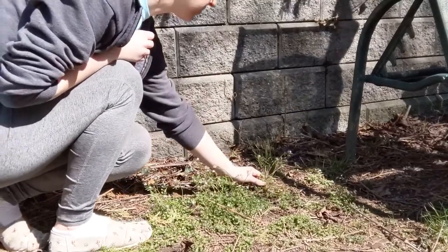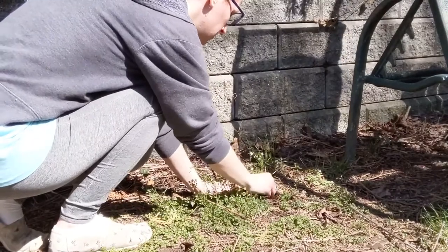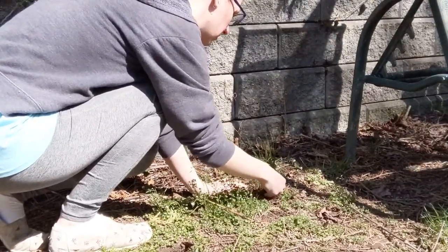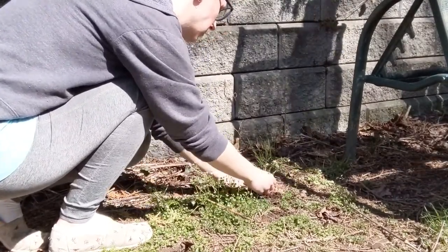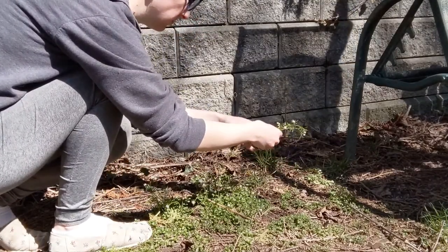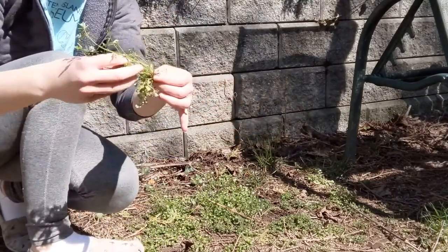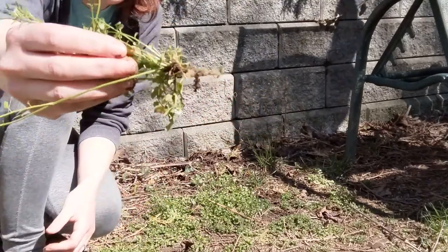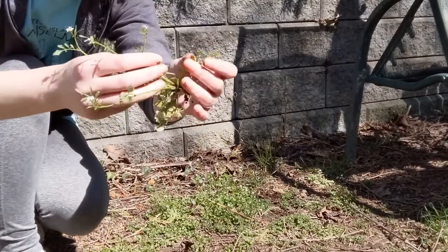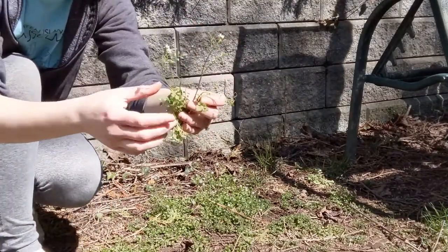Your first step is to go find a plant. You want to look for something that is either flowering or fruiting. You want to dig it out of the ground as carefully as possible, because you do want to leave some roots intact — you don't want to just tear the stems off. As you can see, I managed to get a little bit of root that has diagnostic characteristics, and that little plant is definitely flowering, so that one is ready to go.